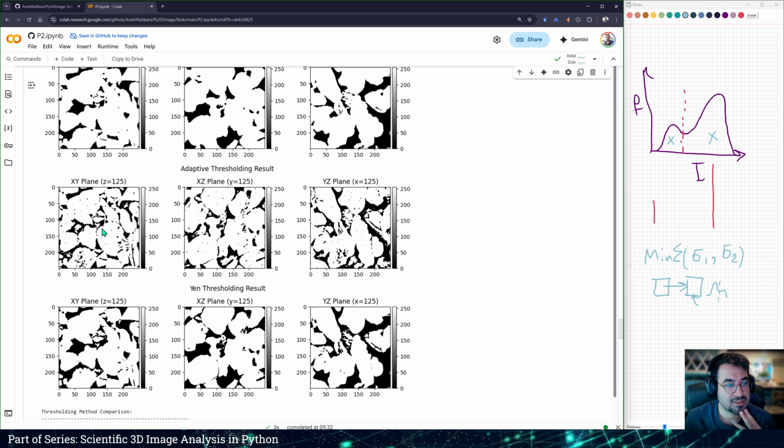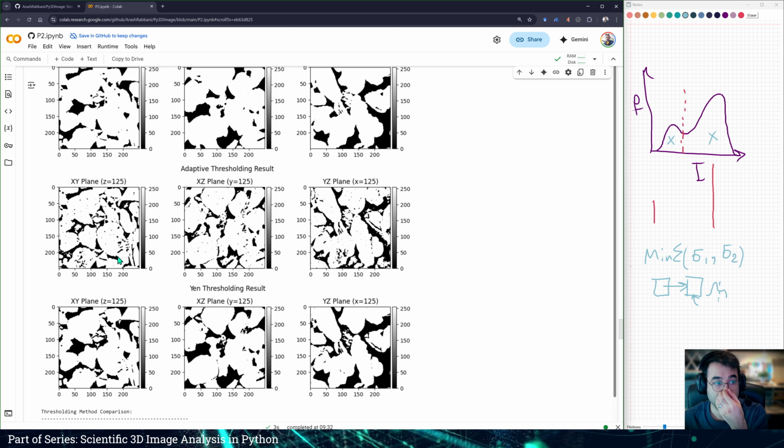The other thing is that you could see some slight spaces inside each of these sand grains. If you know from theory that it makes sense for your object to have those sorts of lower density locations, then it makes sense to go with the adaptive one, right? So again, it's not a perfect science. You need to judge fairly if all those details that you see in the images are real.